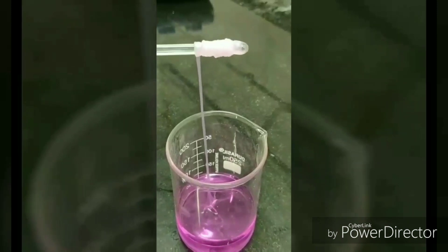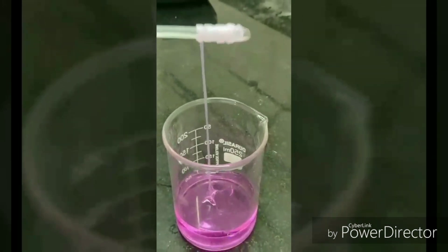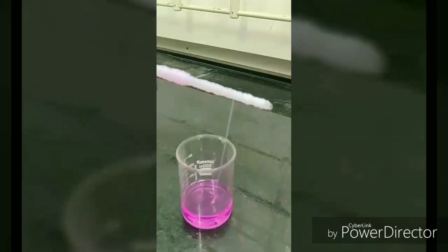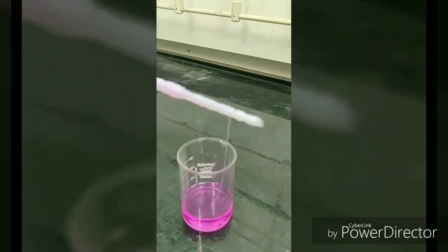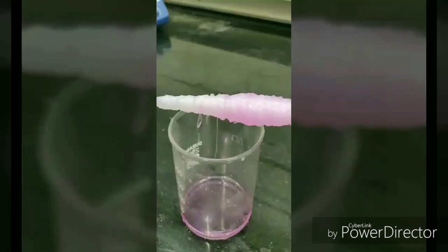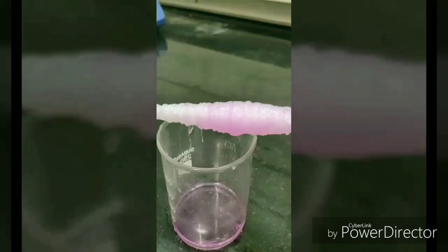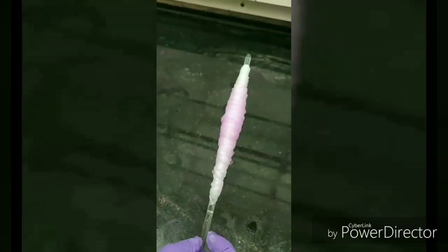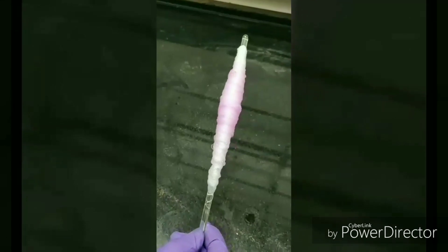Now we roll the nylon fiber on the glass rod until the whole solution is exhausted. The newly formed fiber is soft and elastic, so proper care should be taken while rolling. This is how it looks at the end.